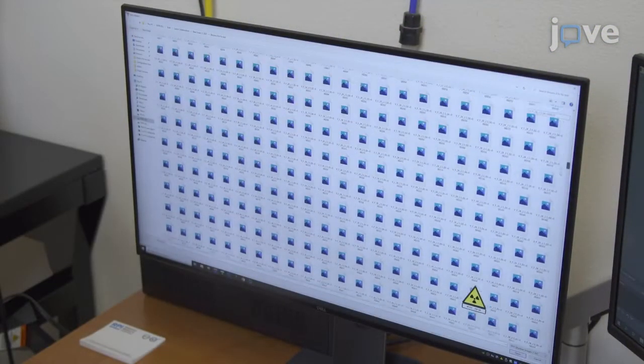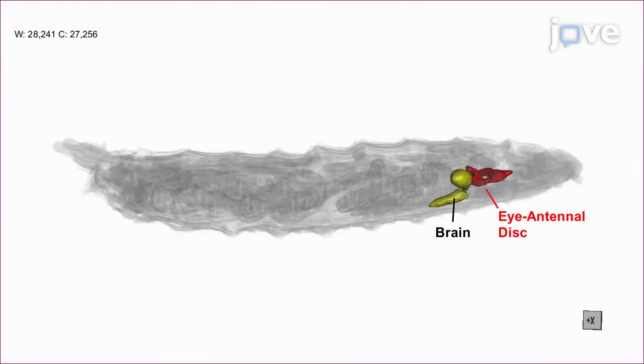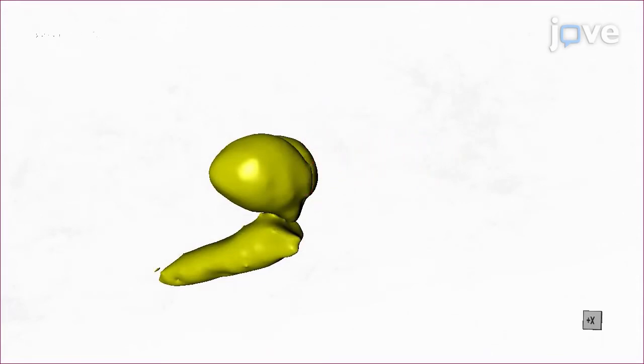MicroCT is an ideal tool for studies aimed at modeling human diseases in flies or for understanding developmental defects that affect quality of life. It has also proven to be useful in other disciplines such as engineering, physics, material science, geology, and anthropology.